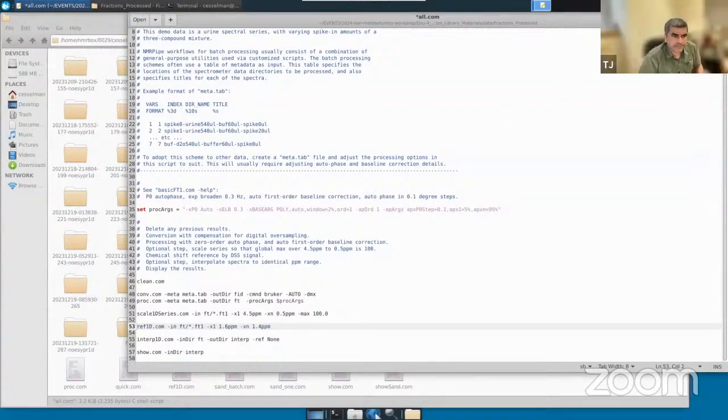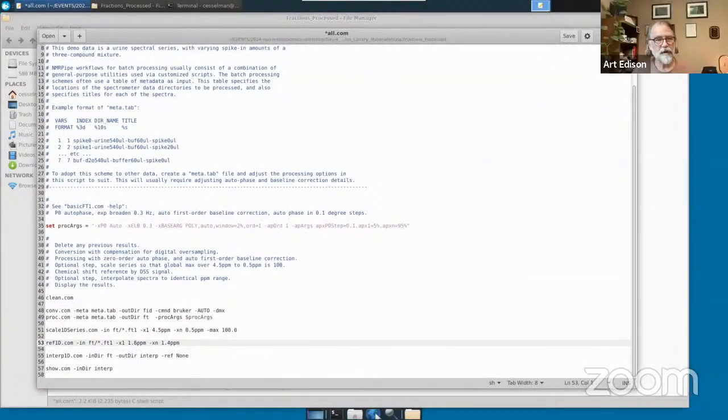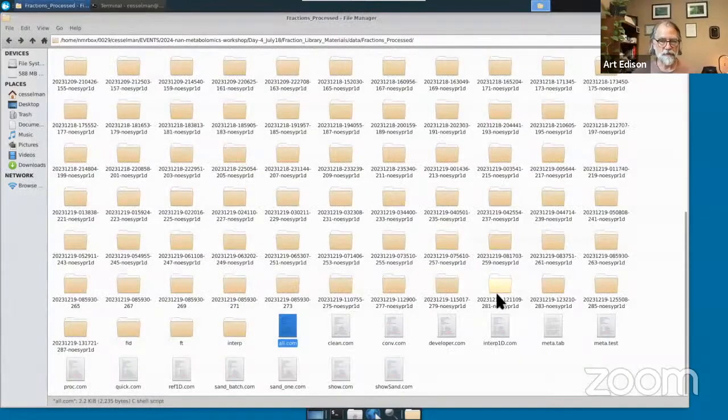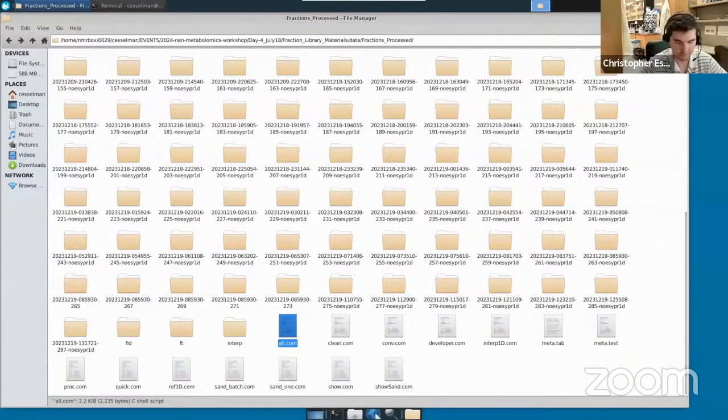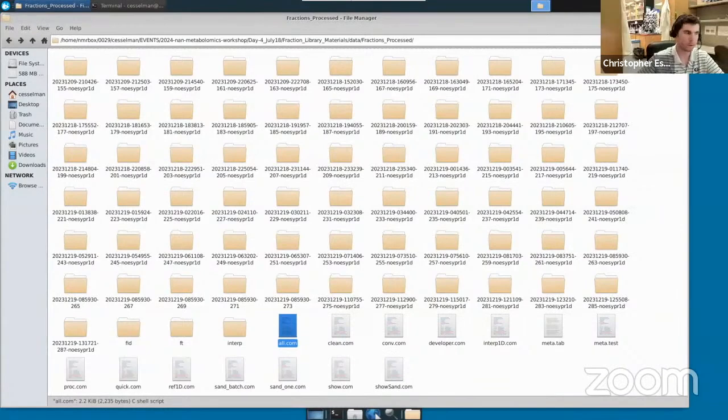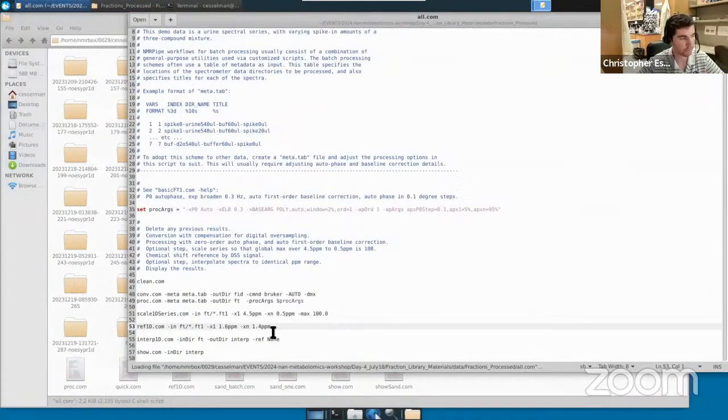Thanks. Cool. TJ, just for clarification, the reference that Chris is talking about is a chemical shift reference. We usually use DSS. In this case with DMSO, I think it's TMS. Is it TMS, Chris? Yeah, TMS. It's something that we would use to calibrate the chemical shift axis.